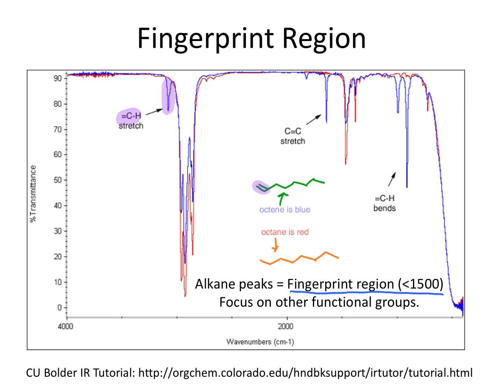It's called that because, first of all, there's going to be lots of peaks over there, but they're really hard to pick out because there's so many things going on. Usually you can't see what it is. Now, it's really like a fingerprint in that if I found your fingerprint at the scene of a crime or something, I wouldn't know whose fingerprint it was unless I had your fingerprint already on file so that I could match it, right? So if I had the exact IR of another compound, it will exactly match, and then I could tell what it is. But unless I've already seen that compound before and have it in a database or something, I won't be able to tell just from looking at the fingerprint alone. Just like if I looked at your fingerprint, I wouldn't know it was you unless I saw your face. Okay, so hopefully that makes sense.